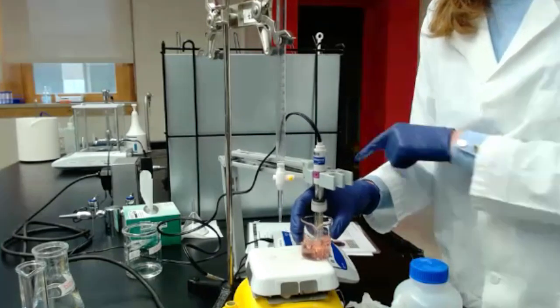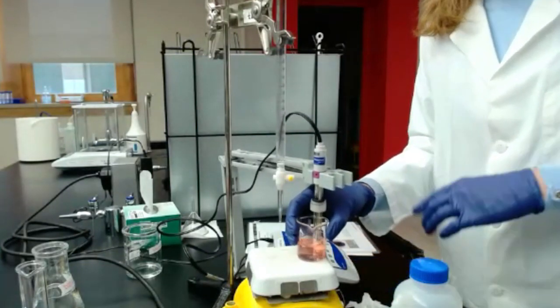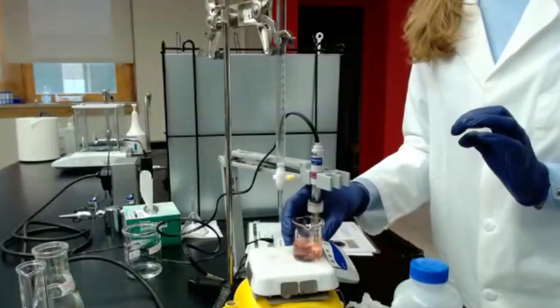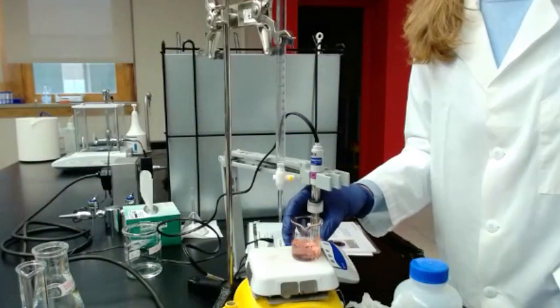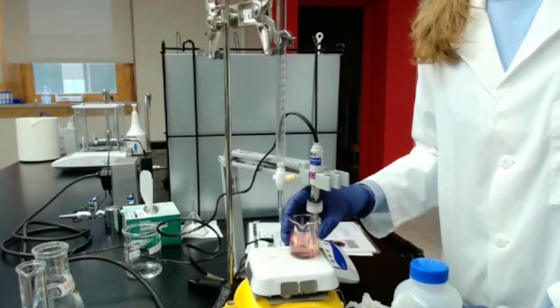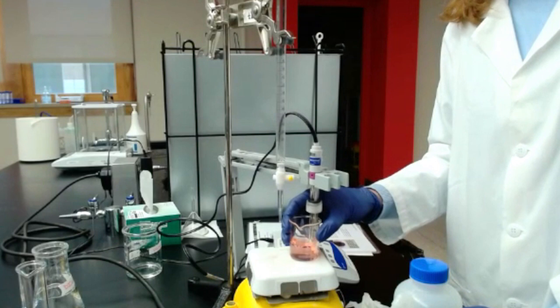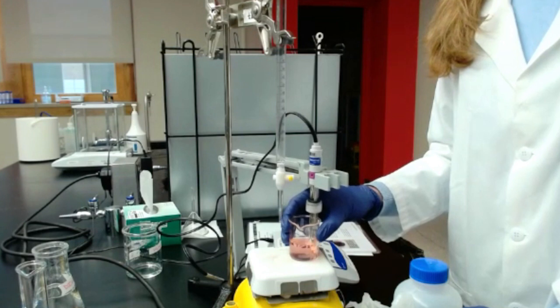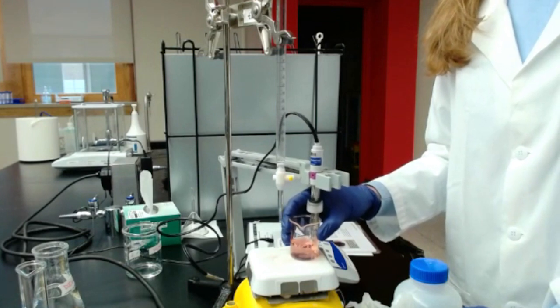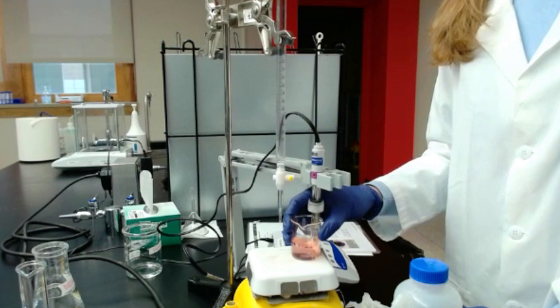Keep an eye on your pH meter until the value is stable. The value should be stable at 4.01 if you are using the buffer of 4.01. Once it's stable, you're going to press again the Calib or the Cal or the standardize or the accept button.